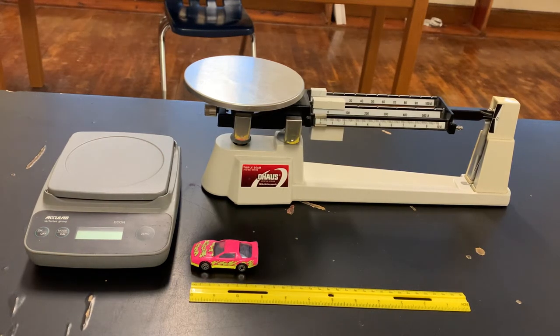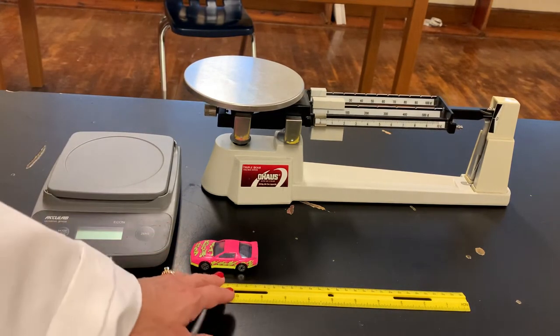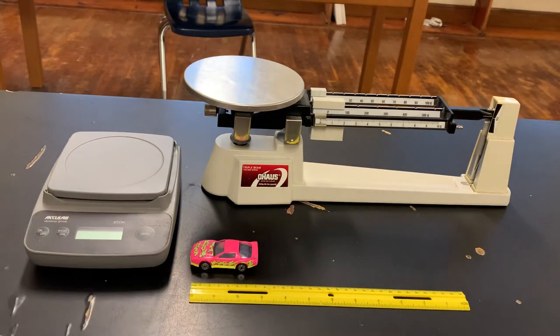Hey everybody, I'm going to be explaining a few things you need to know and remember about some of the science tools we've been talking about. In front of the camera I have several science tools from the lab last class: a triple beam balance, an electronic scale, and a ruler. I also have a car I'll use for demonstration. The correct way to use a triple beam balance or electronic scale is to zero it first — make sure it's balanced or zeroed before you begin weighing something.